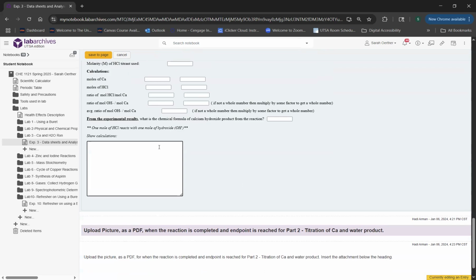When you're looking at writing these out, it is going to be important to write out formulas, like plug your numbers in, show them like 0.97 plus 0.10. You're going to want to type your numbers out, remembering units if you need to have units here.